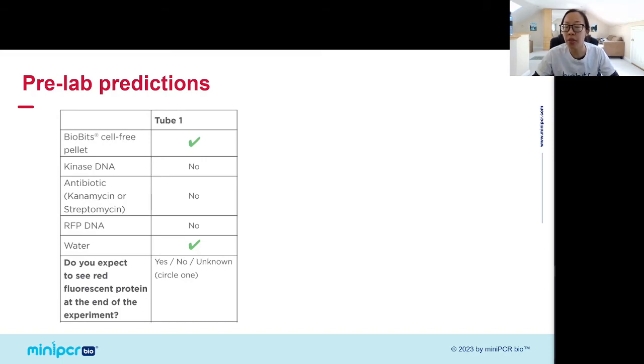Our moderators are in there, so if you have any questions, by the way, feel free to pop them in the chat, and one of us will answer your question. All right, so that's tube 1.